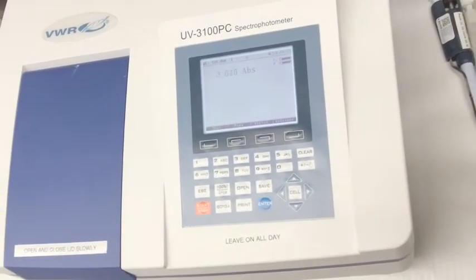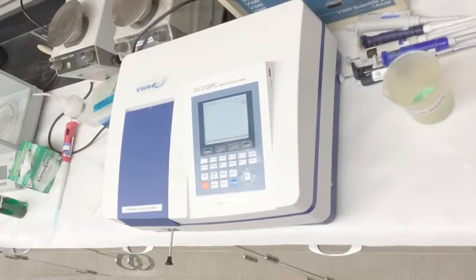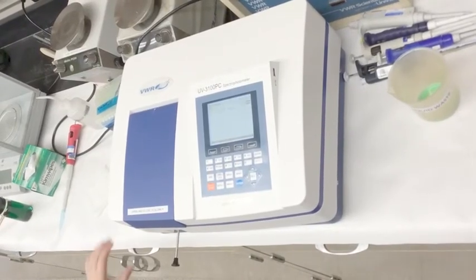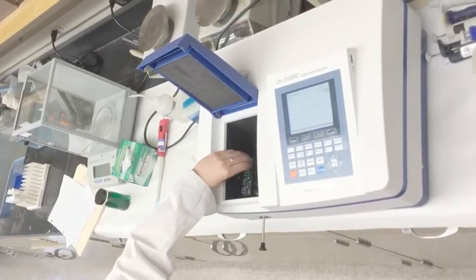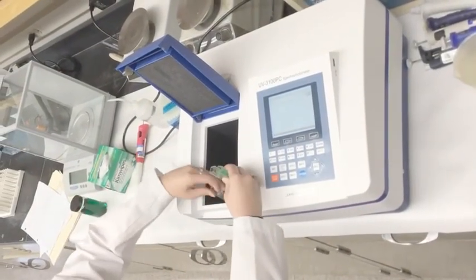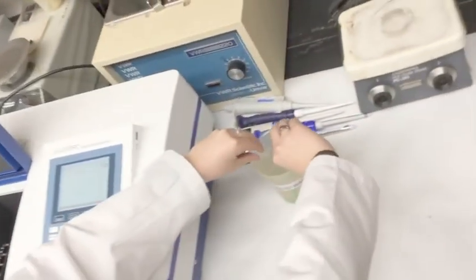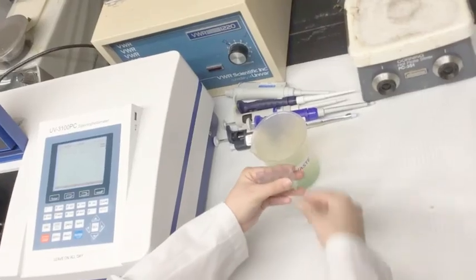At this point, you have read all of the cuvettes in the machine. In order to remove the cuvettes, open the lid slowly. Grab all of your cuvettes and empty them into the liquid waste. You should then wash the cuvettes out with DI water and invert them to dry.